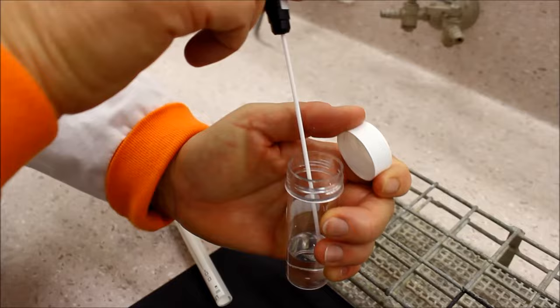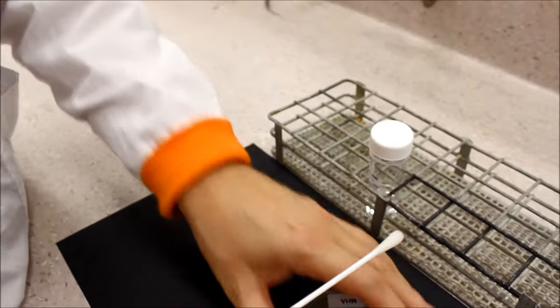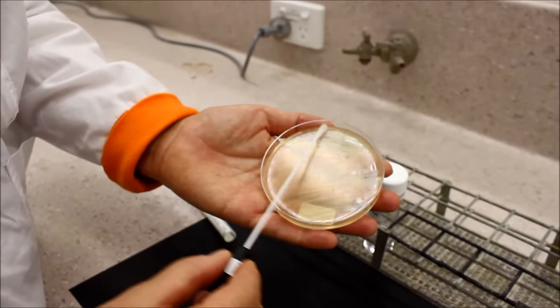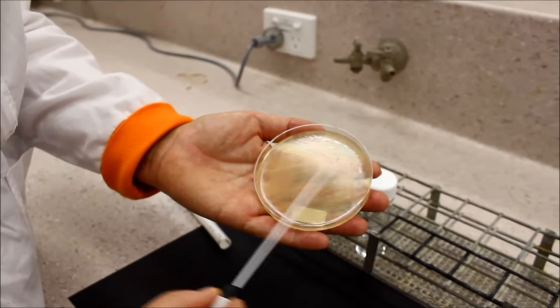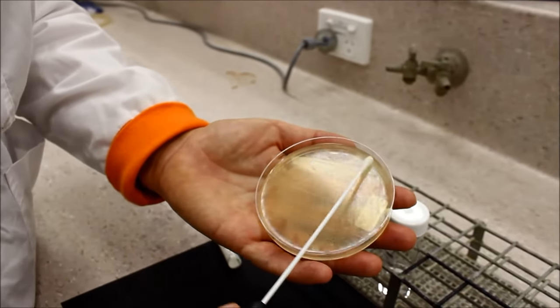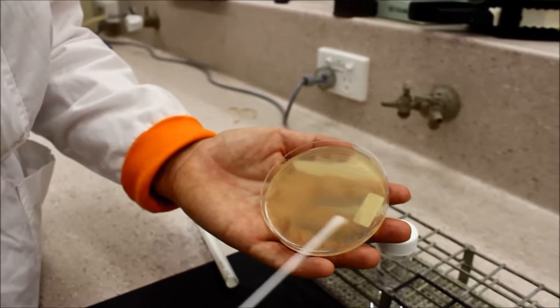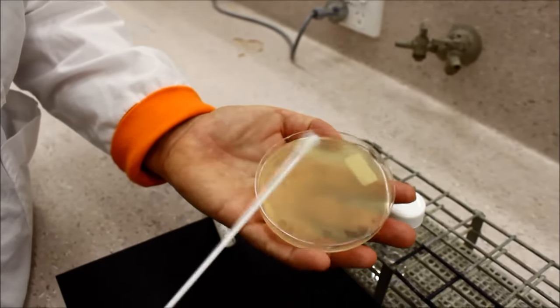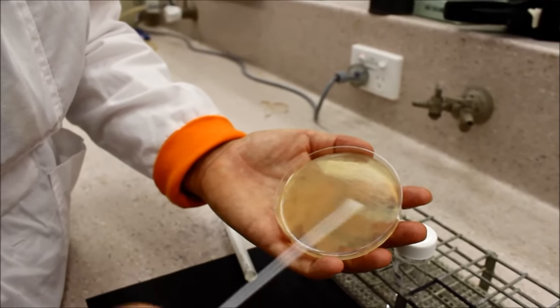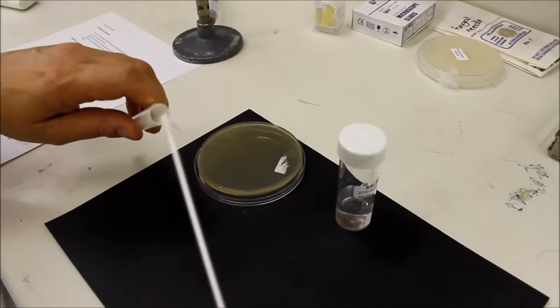Soak the swab again and repeat the streaking procedure a second time, ensuring that the plate is completely covered with the inoculum. Place the used swab in a swan bag.